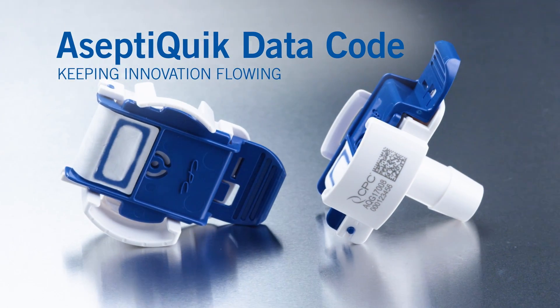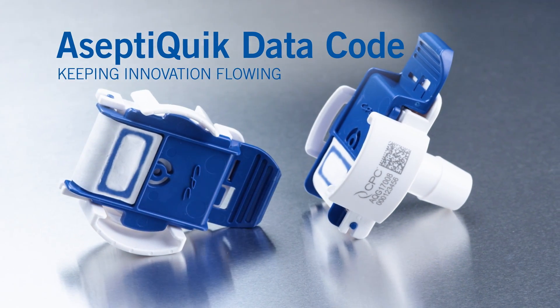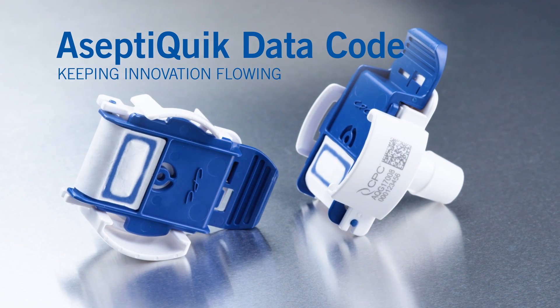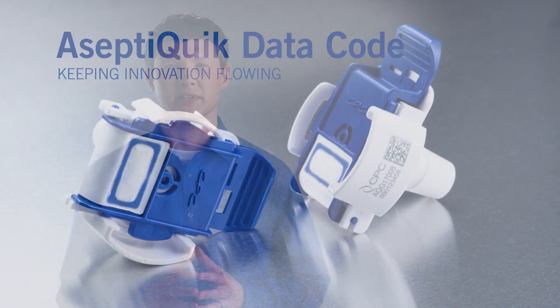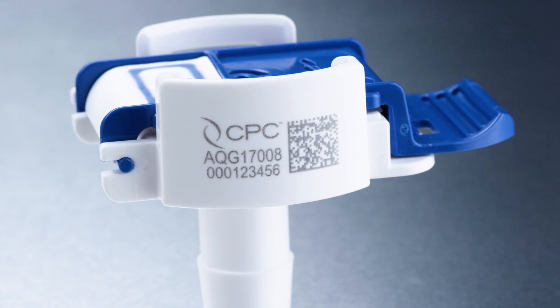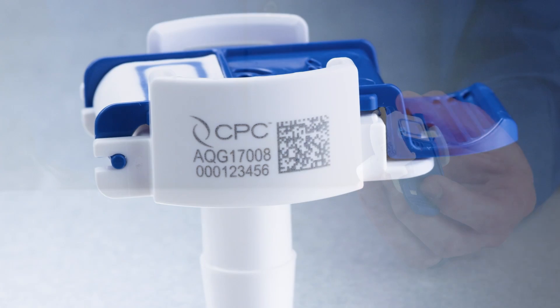Robust and reliable, the AseptiQuik family of connectors provide fast and easy sterile connections even in non-sterile environments. And now, to further improve proper use and minimize operator error, each connector is laser etched with a data code.